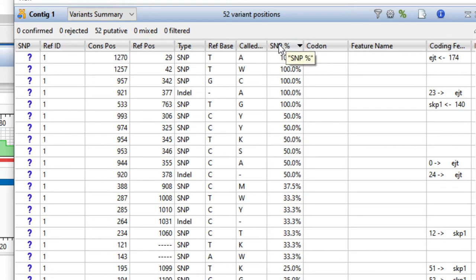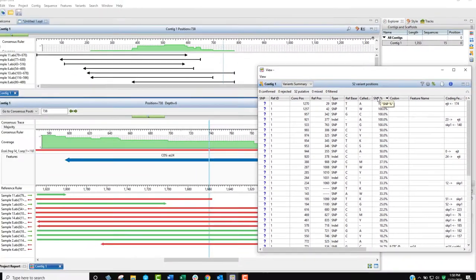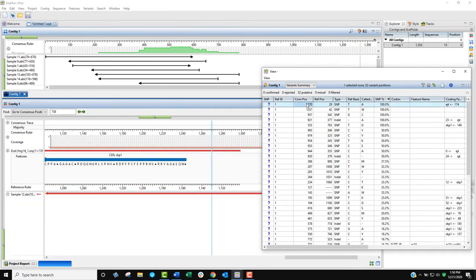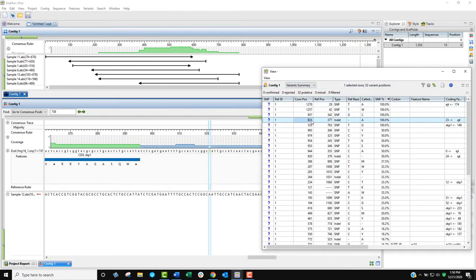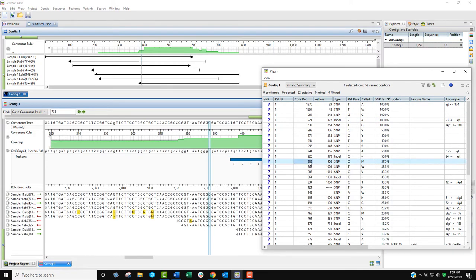Selecting any variant in the table will cause the alignment and strategy views to jump to that position. This allows the variant to be viewed in context.